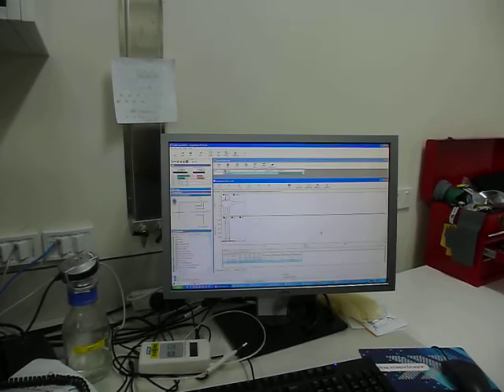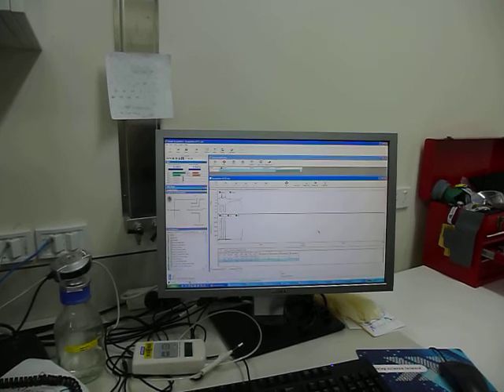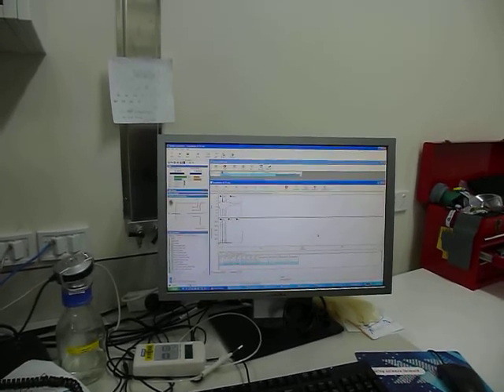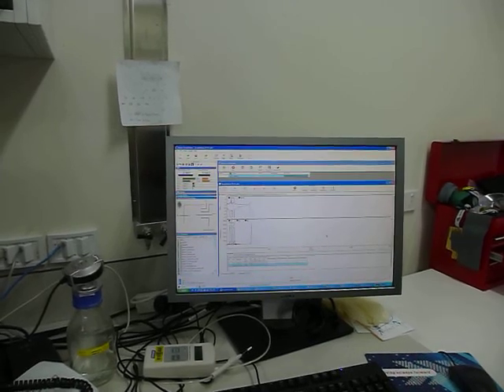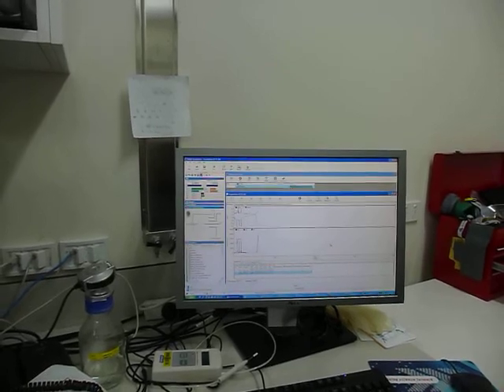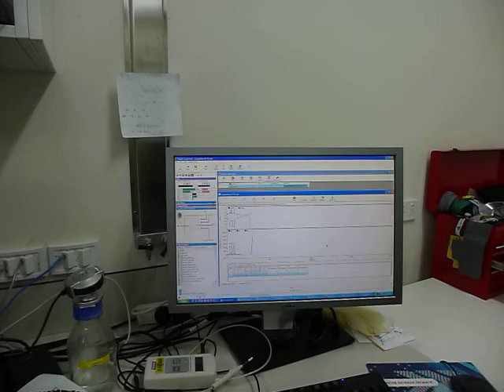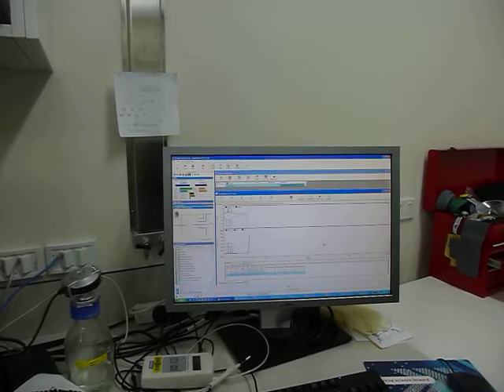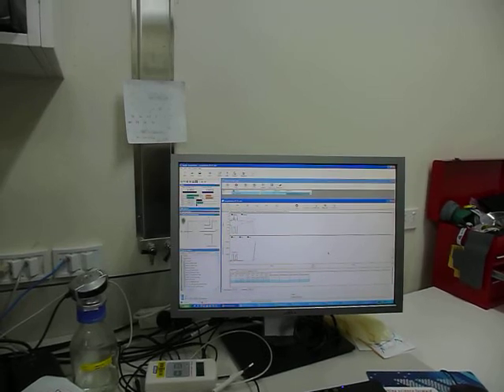This is the first peak, because there will be two peaks. This is the inorganic carbon that comes from that reaction with acid. It's a big peak because it's a very concentrated solution. I'm afraid it can be too big and go above the scale of the IRMS.